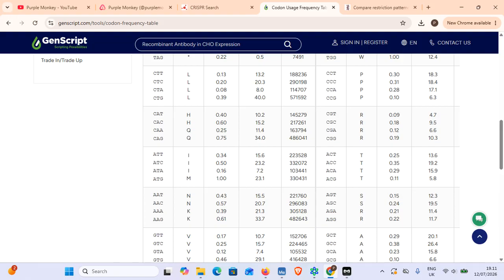So we know that a PAM site can be either NGG or NAG, which does spell nag, and so basically you don't want to turn a PAM site into a NAG, because that will still confer some cutting. And since we're dealing with the opposite strand, that means we don't want to turn CC into CT. Still paying attention?